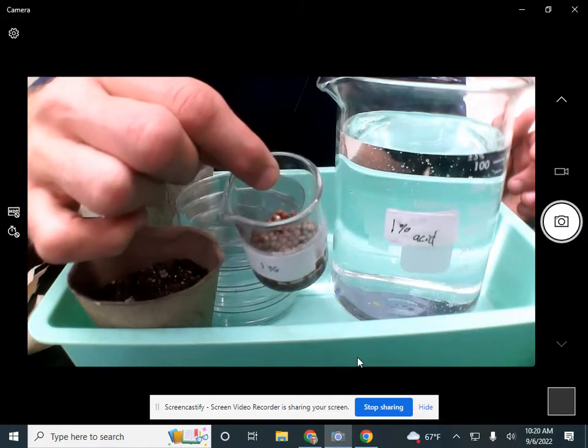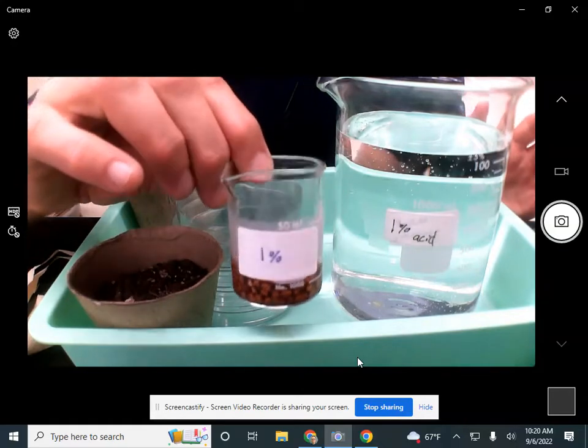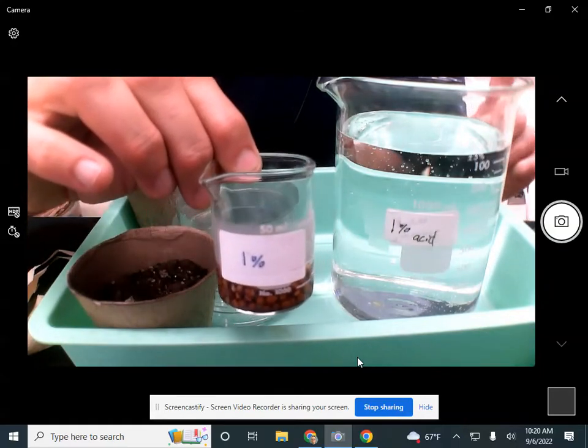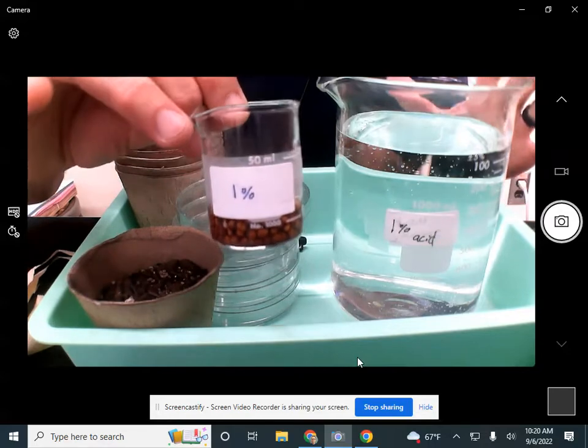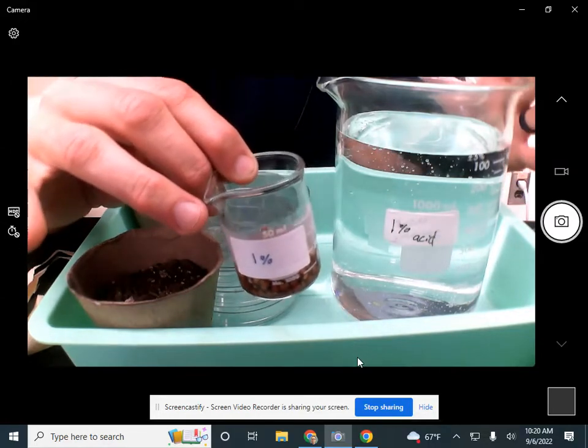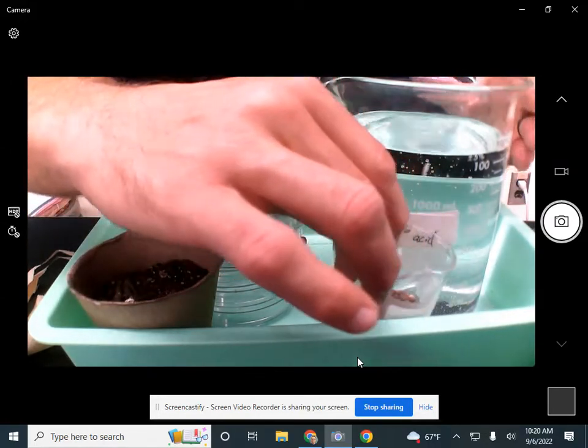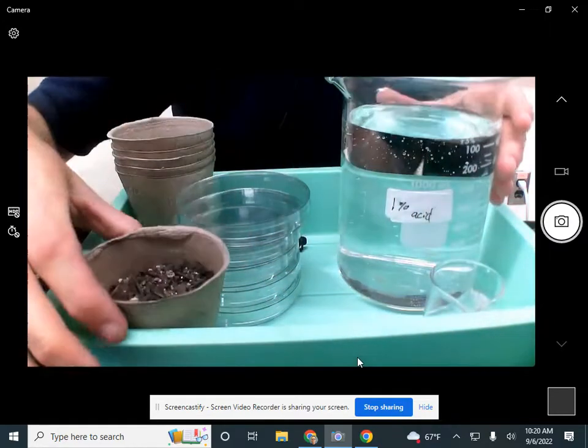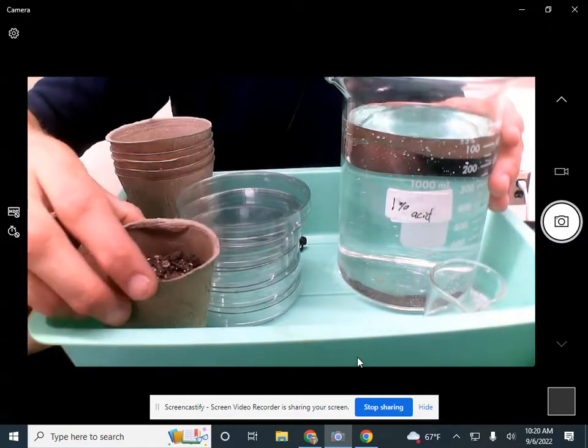I'll put some tweezers out so you can grab them. Nothing hazardous here. This is vinegar diluted down to 1% vinegar. So obviously don't eat anything. Don't taste anything. You can't do that in a lab, but that's what that is. Once you have your seeds in there, set those off to the side.